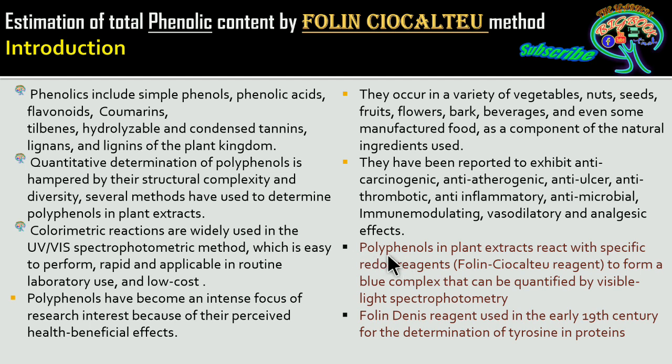Now further, polyphenols in plant extracts react with specific redox reagents. The most highly used reagent is the Folin-Ciocalteu reagent.